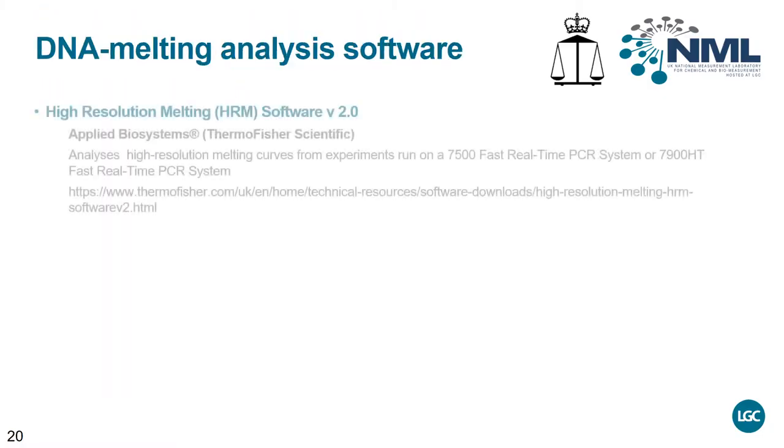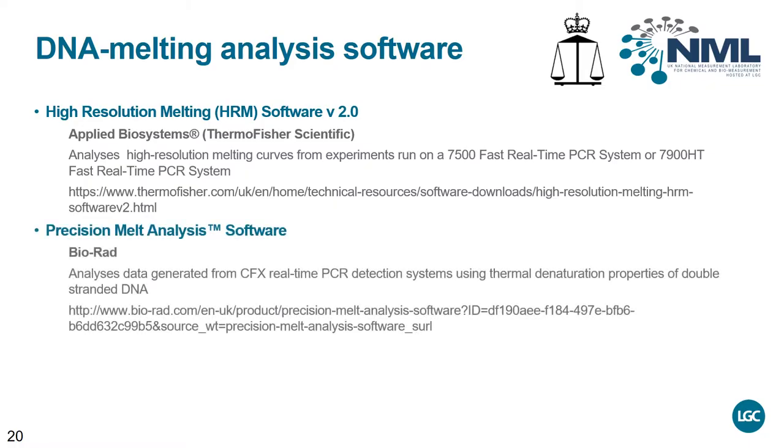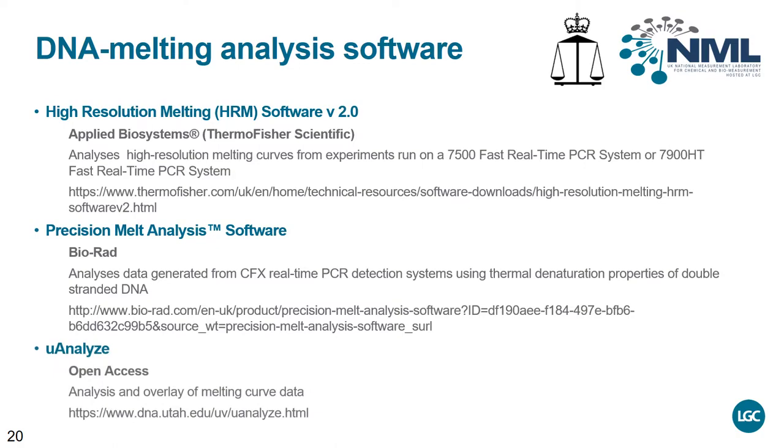A number of software packages are currently available for analysing DNA melting curve data. Many of these have been compiled for use with specific platforms. However, a number of open access applications and macro-enabled spreadsheets are also available. Examples of available software are shown on the slide.